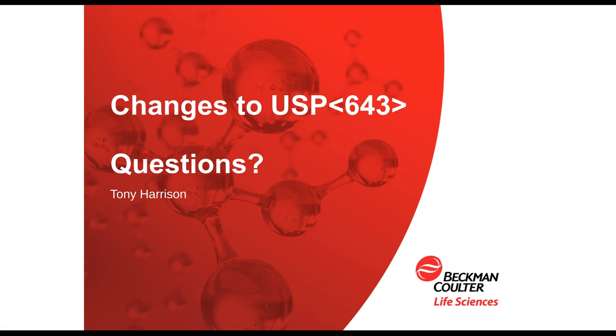Thank you so much, Tony. And we have one more question from our audience. Why does the Japanese Pharmacopoeia call for system suitability testing on SDBS only? Good question. And as I said earlier, the scope for the Japanese Pharmacopoeia is broader than that of the USP chapter on TOC.